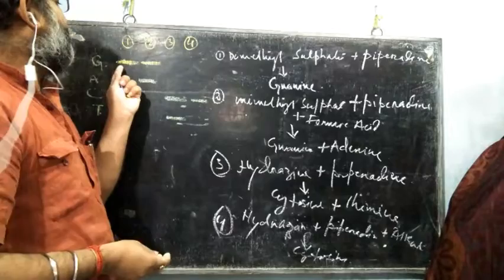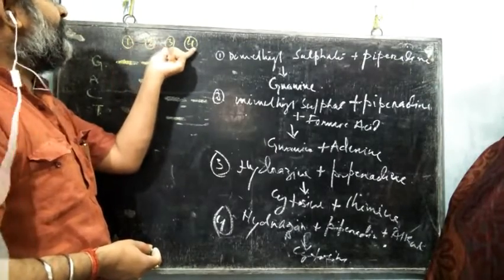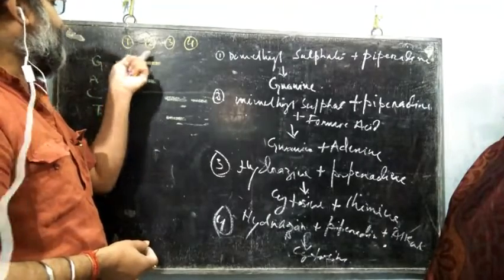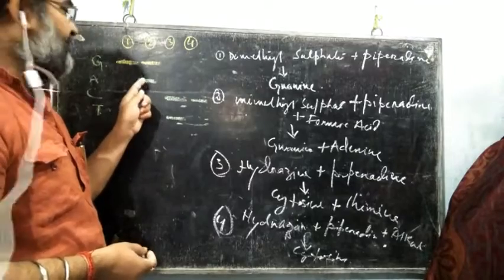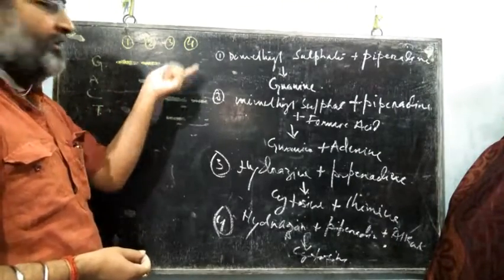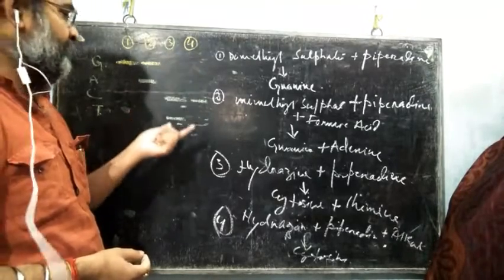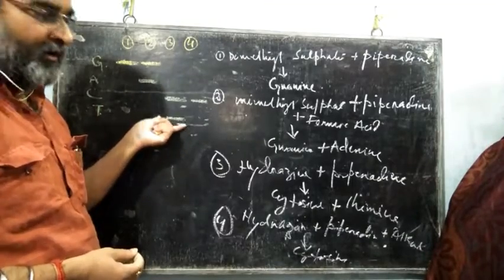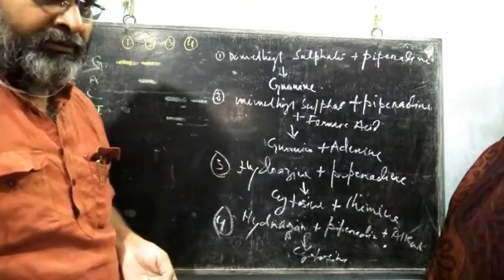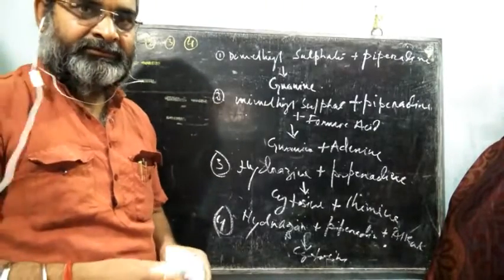That means lines 1 and 2 represent the purine line and 3 and 4 represent the pyrimidine line. In the purine line, if two bands are present, in both first and second, it represents G. But if one band is present only in the second line, it represents A, adenine, adenylic deoxyribonucleotide. Likewise, in the pyrimidine line, it represents C if both bands are present in the third and fourth line, and T if the band appears only on the third line. Now, I suppose that it provides a clear-cut concept for the analysis of banding pattern as in the Maxam-Gilbert method.